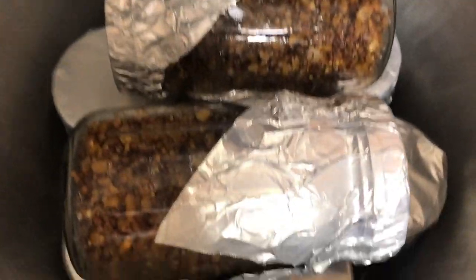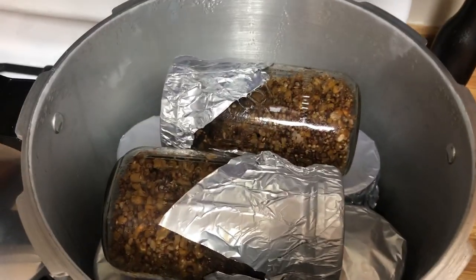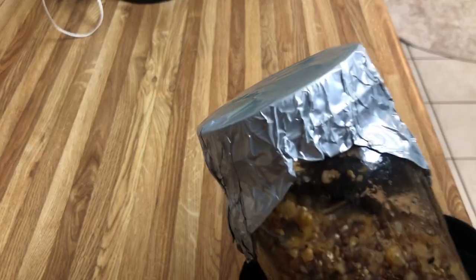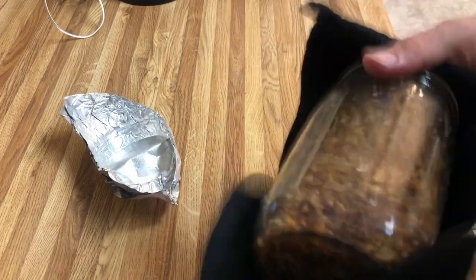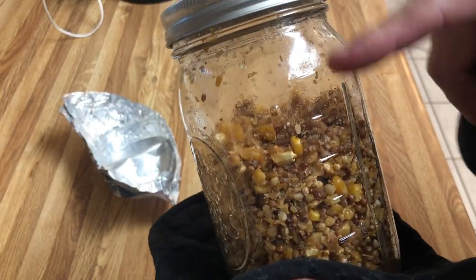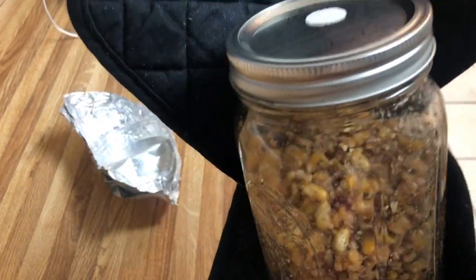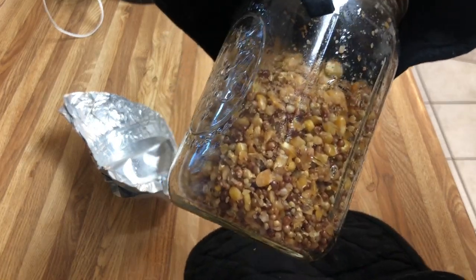All right, so this is what we've got. Looking pretty good. 9 jars. Boom. Crispy. All right, so now what I do is I pull the jars out and I just take off the tinfoil. Let me give them a nice shake to redistribute the moisture. There we go. So remember, I'm doing grain to grain with these. And I like to put a pretty good amount of grain in there so they colonize really quickly. So I have about 1.5 inches of space. And all the jars look like this. So we're just gonna pull them out and set them aside and let them cool.